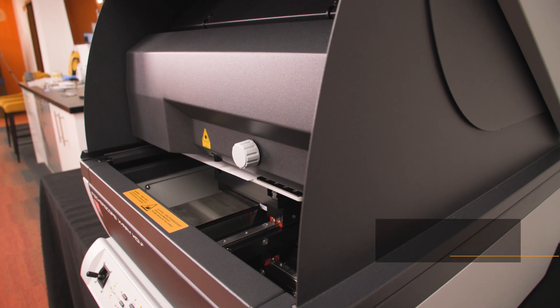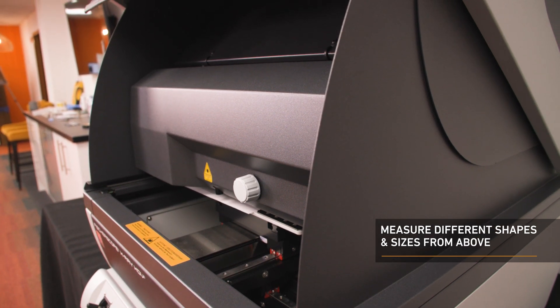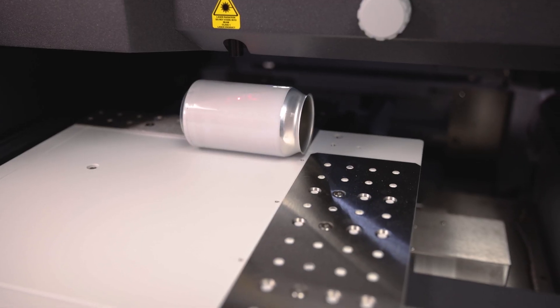The instrument has an X-ray beam in a top-down measuring direction and a large measurement chamber, so parts with complex geometries are measured from above.